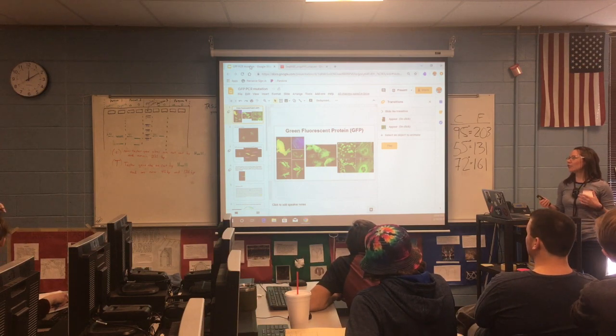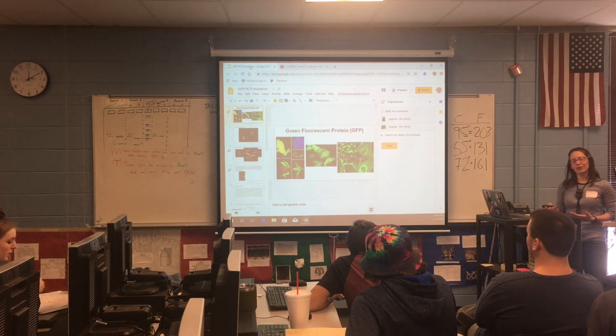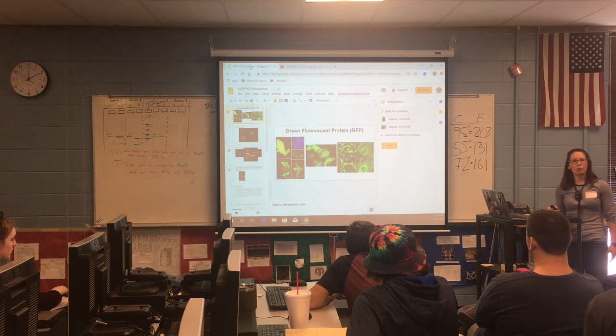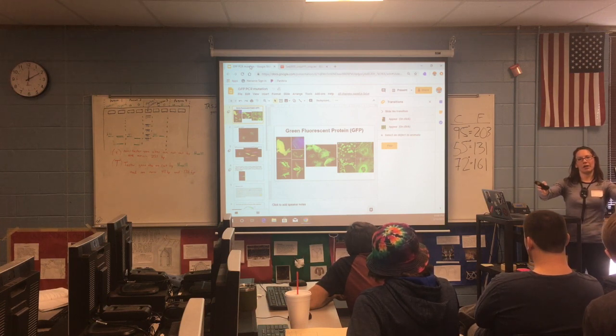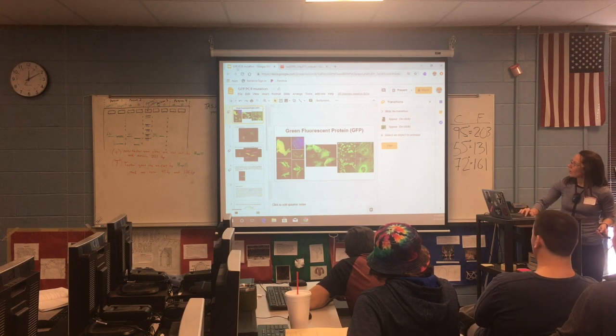Especially if you want to be really accurate with what you're doing. So if you're just doing a PCR reaction, you could probably do 100 of them for $200. Maybe $2 a reaction. But if you really care about the sequence of your DNA, which we are going to talk about why we might care about that, and you guys might care about that for your previous lab, it's going to be a lot more expensive.